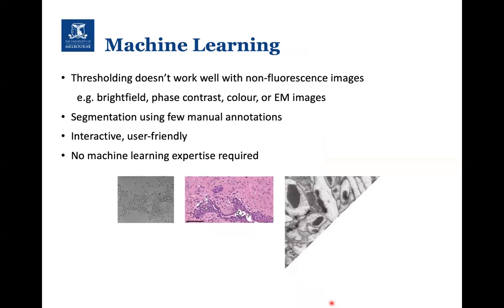There are now, of course, machine learning algorithms available, which will help you to threshold, especially if you're using things like non-fluorescence images. So things like bright field, phase contrast, color, or electron microscopy images.